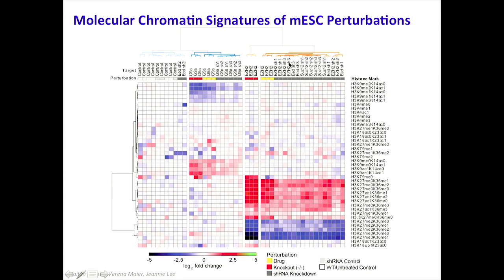So again, what you can see here across the top are the names of the genes that we knocked down, and we used at least 2 or 3 different small hairpin RNAs to knock down those genes. So we have kind of biological replicates, technical replicates. Well, they're actually all biological replicates here, but we have different ways of knocking down the gene. So we make sure that no matter how we get there, we get to similar answers.